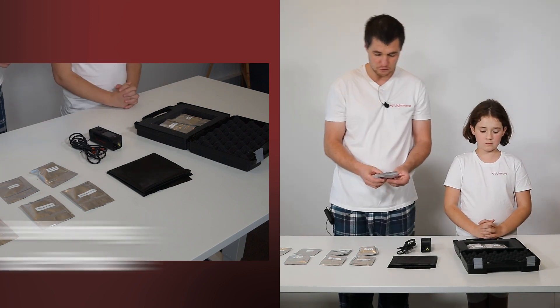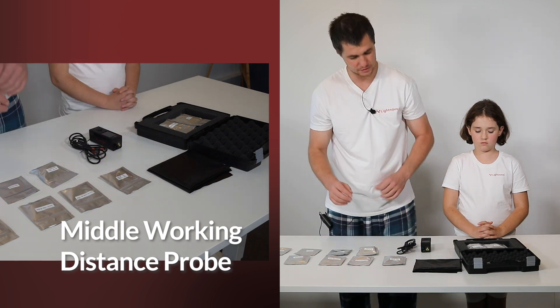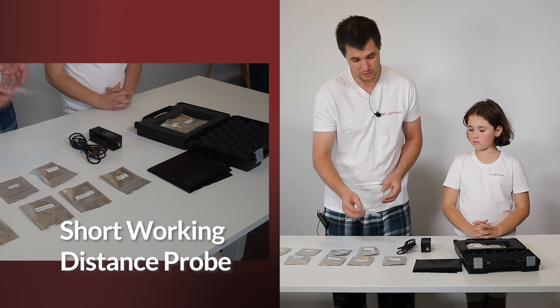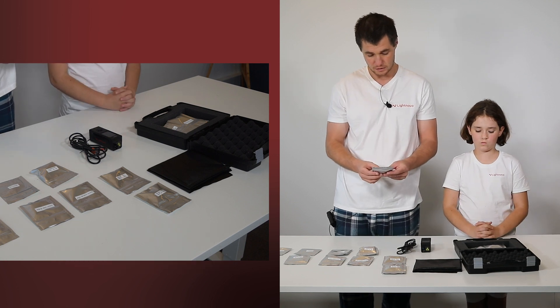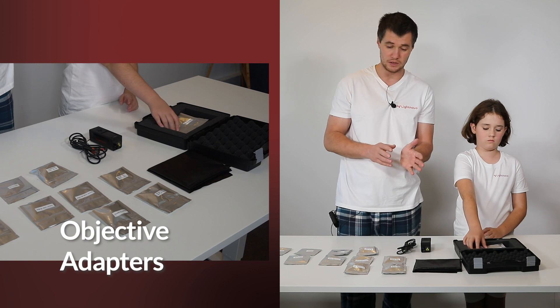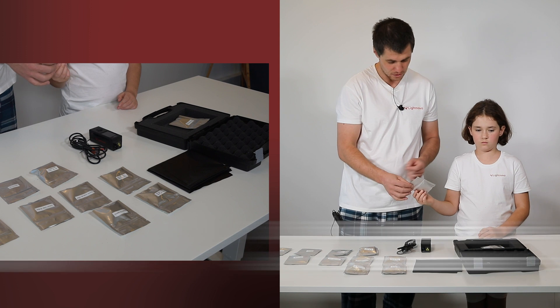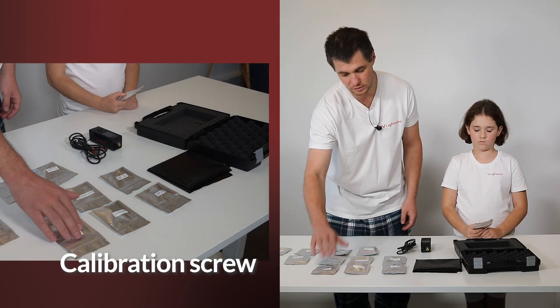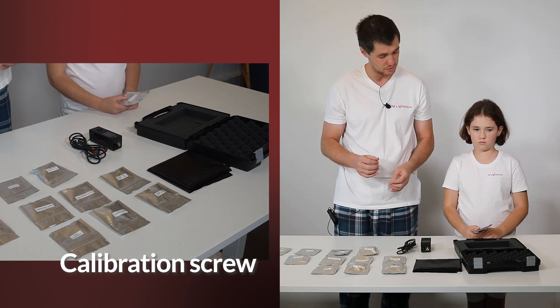A middle working distance probe. Short working distance probe. And objective adapters — those are the adapters which you can attach to Miniraman and then connect Olympus or Nikon objectives. Calibration screw — this is a screw with inbuilt polystyrene which you will use to check the performance of Miniraman.